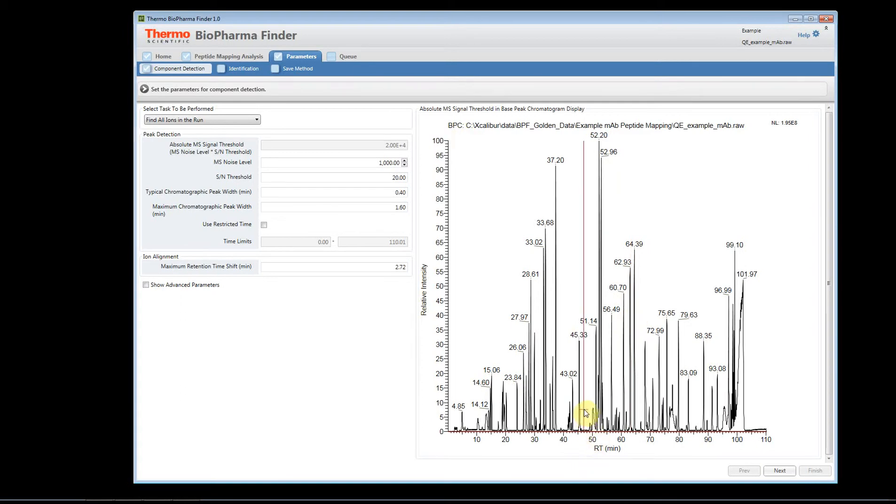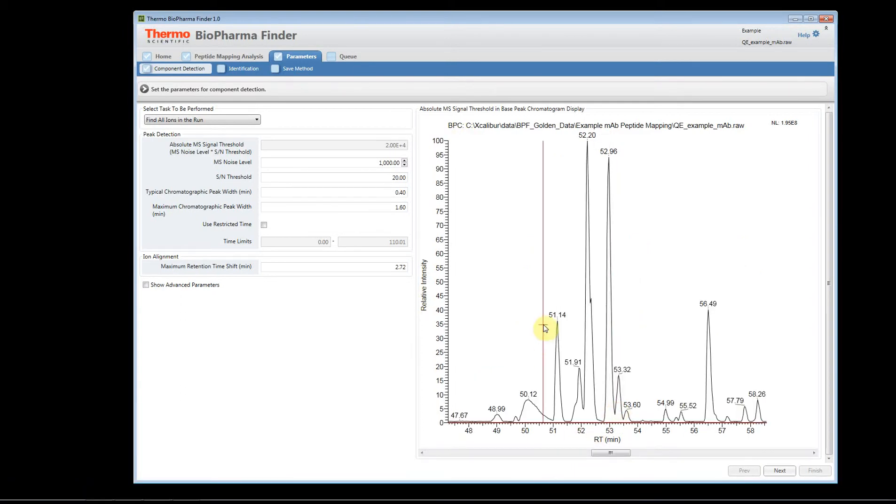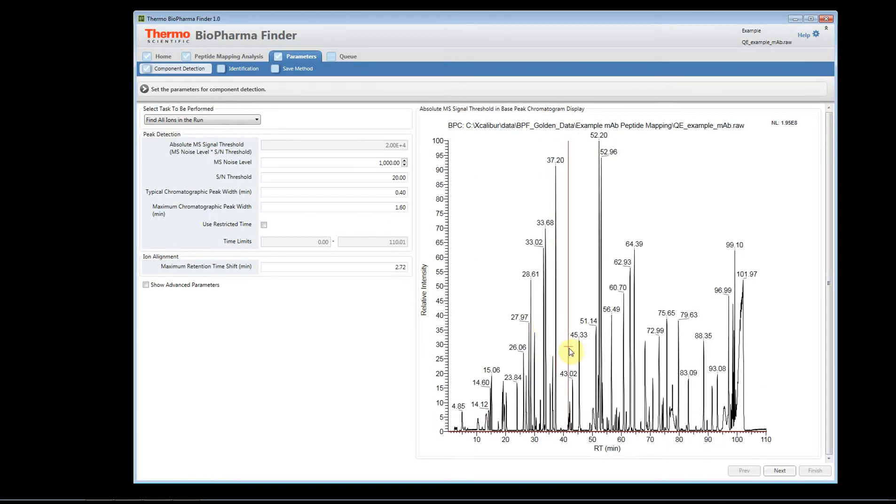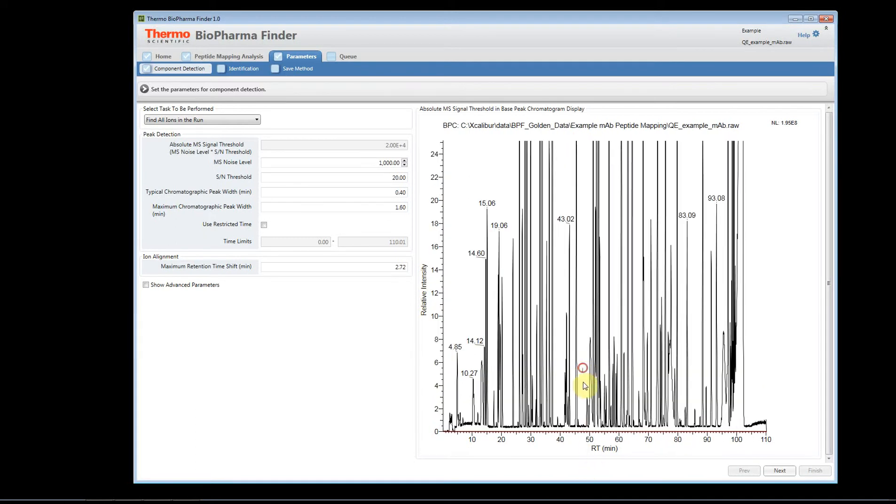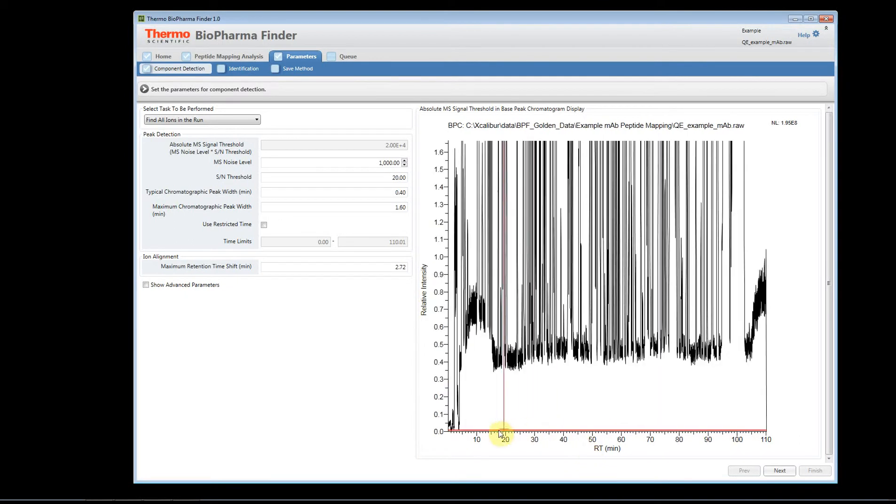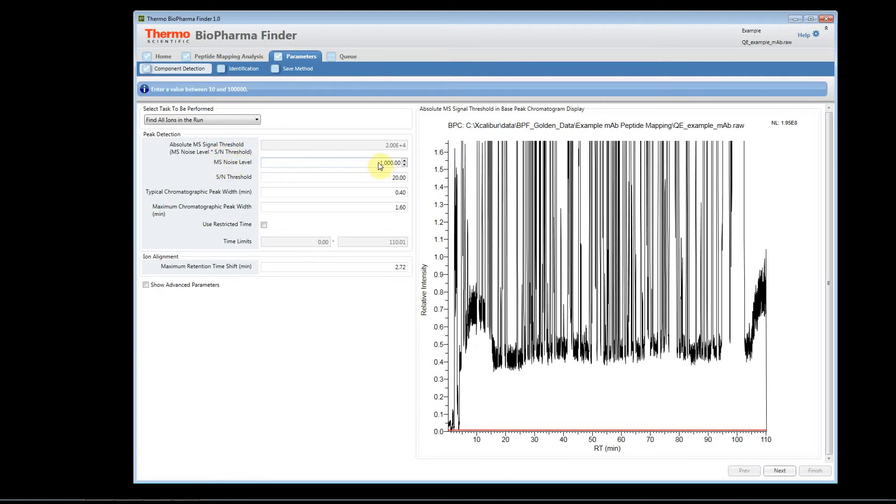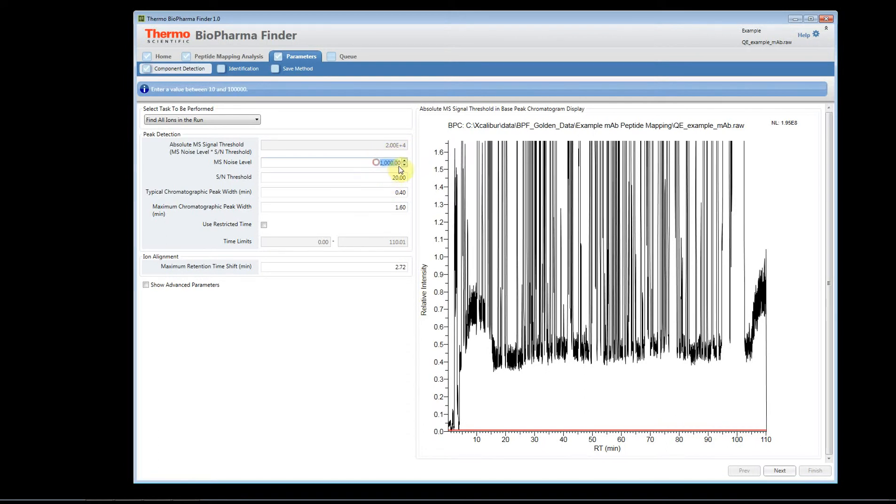And you can interact with this. You can zoom to unzoom. Just simply double click with your left mouse button. You can zoom in the y-axis. And you'll notice as I zoom down, you're going to see a red bar. This red bar is actually the absolute MS signal threshold. And this calculation is done, it's a product of the MS noise level times the signal-to-noise threshold. It's a product of this parameter multiplied by this parameter. You'll notice this value here is grayed out. In order to change that value, you're going to either change this parameter or this parameter.